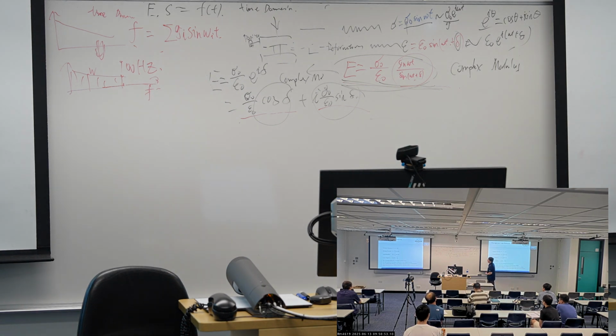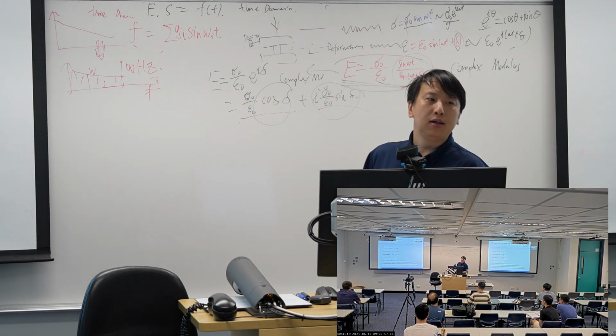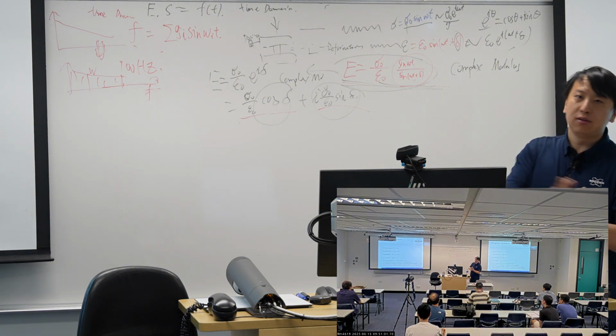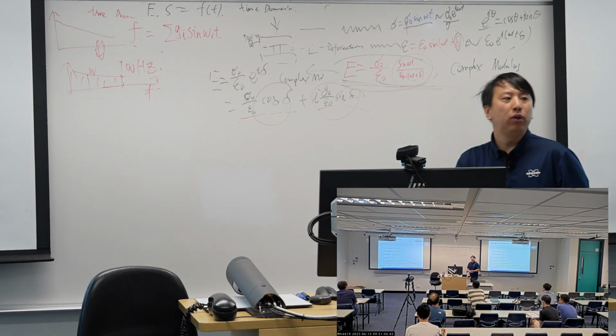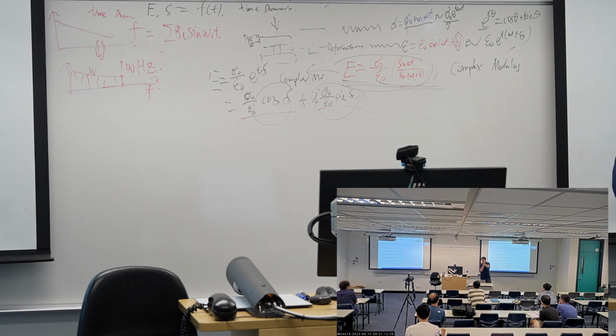And the AFMs, the facility's Icon, they can provide you two options. The first is also from 0 to about 100 Hertz, and we have a high frequency option, right? And the tiny one behind the stage.